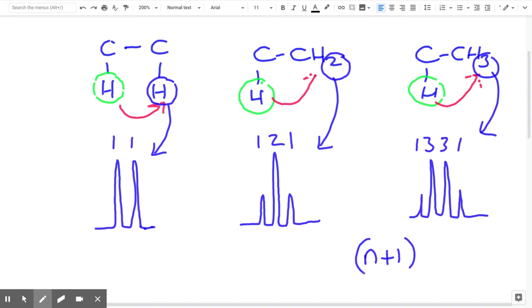So when you are looking at the integration ratios of a peak, which you've got in a molecule, remember, the integration of all of these peaks in total are the same. The only thing we are seeing is the shape of the peak. So all of the green areas from the start to the finish of the peak are all identical in all 3 examples because they are contributing to the integration of 1 proton. Remember, we are looking at that proton in each of the 3 examples.